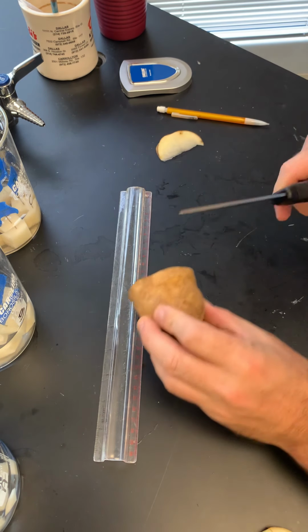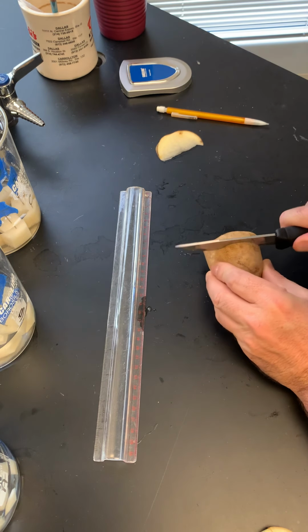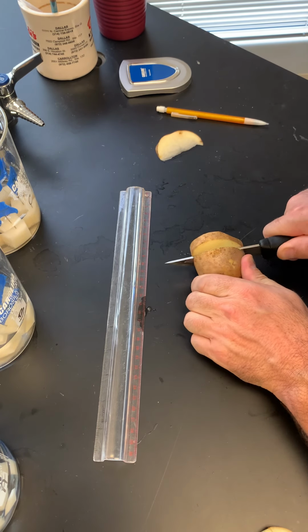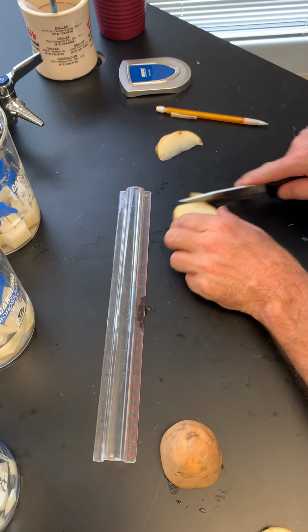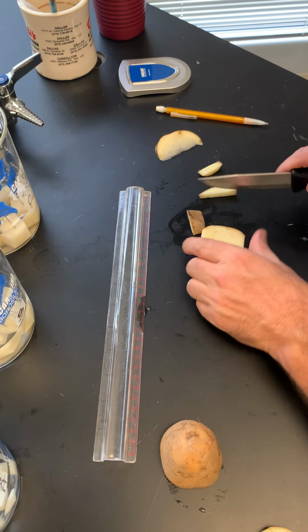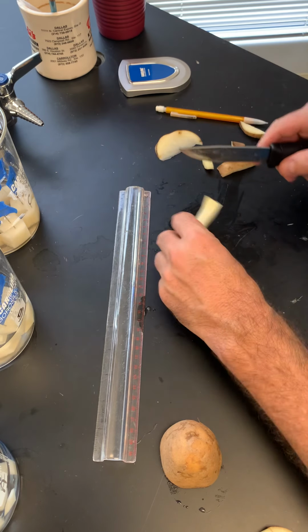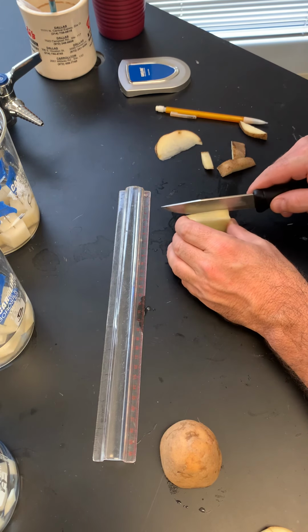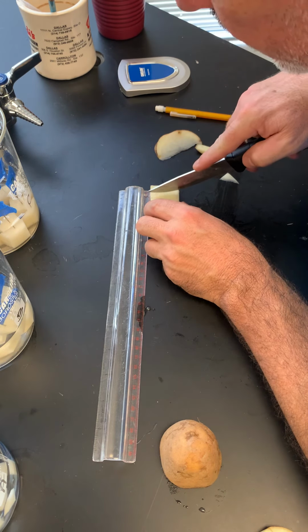So I'm going to score it. That's where I'm going to cut. That is 1 centimeter, so I'll cut a slice. Now be careful about it. You guys aren't kindergartners, you're not going to cut your finger off. And now I'm going to cut the edges off. I don't want the skin. That's like an extra membrane, an extra way for water to get in and out. There's a little bit of extra on this diagonal, so I'm going to cut diagonally. There we go. There's 1 centimeter there.